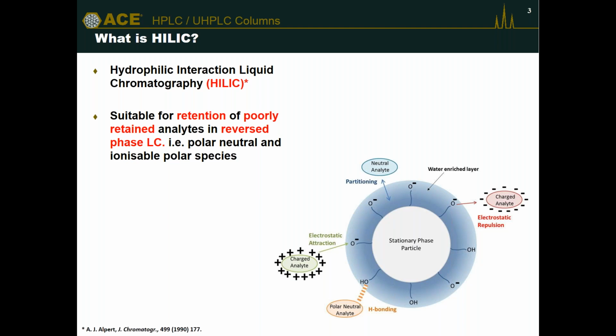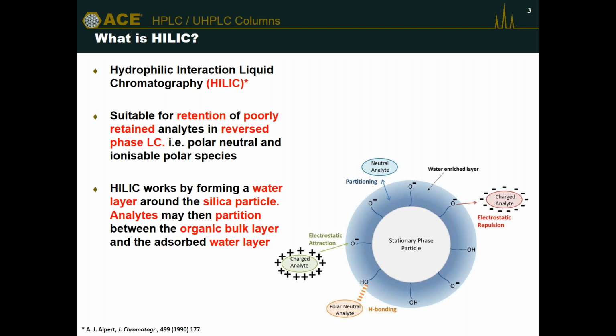So typically that is analytes that are quite polar. They may be polar neutral compounds, or they could be polar ionizable species. Now, the way that HILIC operates as a technique is that a water layer is formed around the stationary phase particles, and analytes can partition into and out of this water layer.